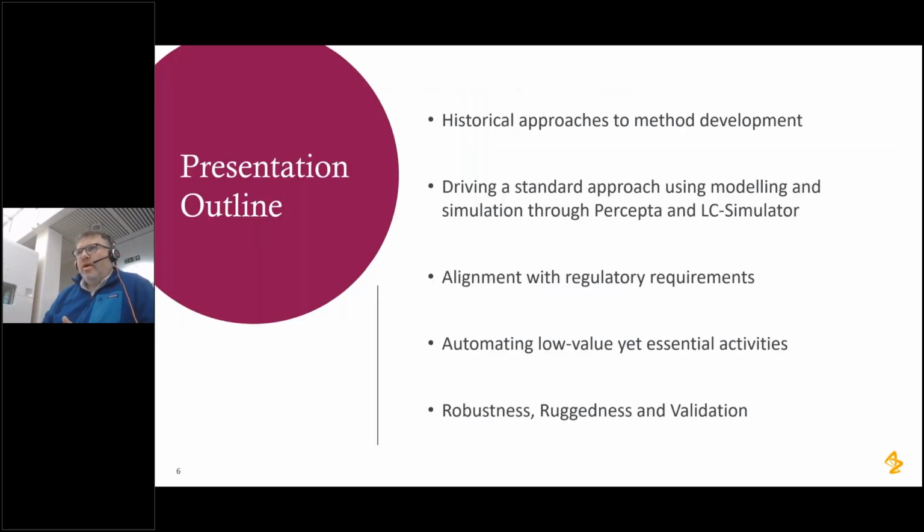So just to touch on what I'm going to talk through now in a bit more detail: how we've historically done our method development and what we've done to drive to a more standard approach using modelling and simulation, using ACD Labs Percepta and LC Simulator as tools that help us to deliver some of our modelling and simulation understanding. I also wanted to touch on how this aligns with some of the regulatory requirements that are now coming into play from the ICH group, and also how we've been able to remove a lot of what we call essential waste activities.